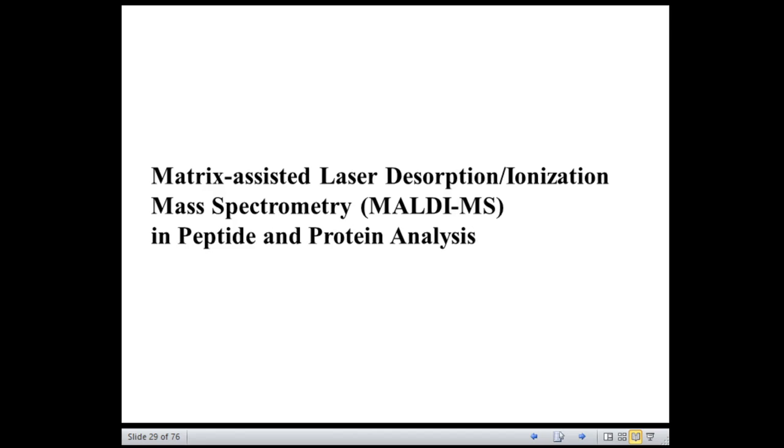In MALDI, that is matrix assisted laser desorption ionization, the analyte is first co-crystallized with a matrix.